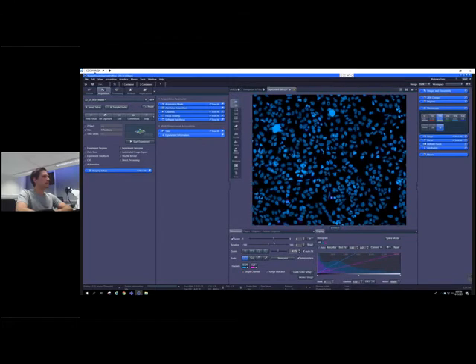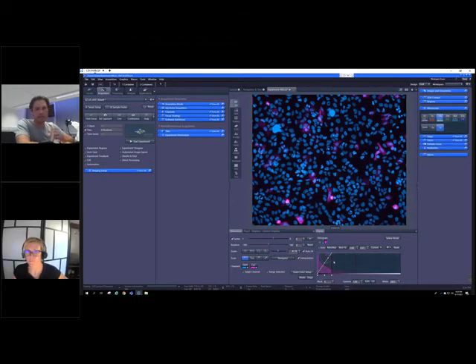So the AI Sample Finder really helps to set up experiments like that, because the calibration of such a carrier is directly done by the AI Sample Finder in the initial Sample Finder process.